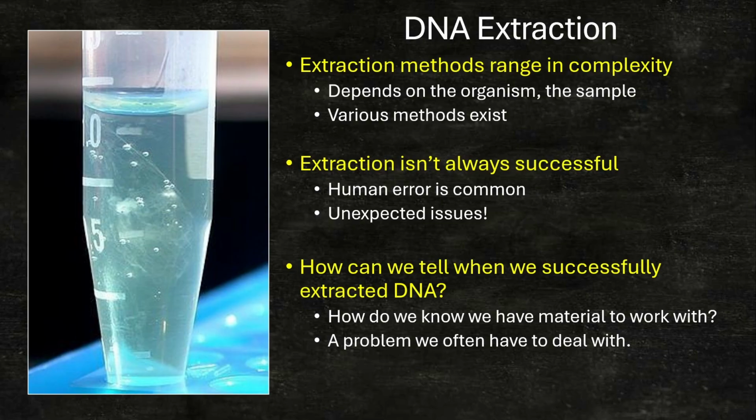An important additional step to this research is to have a method that helps us make sure that we have successfully extracted DNA. How can we tell after we have done a DNA extraction that we actually have enough material to do the rest of our research with? This is a really common problem.